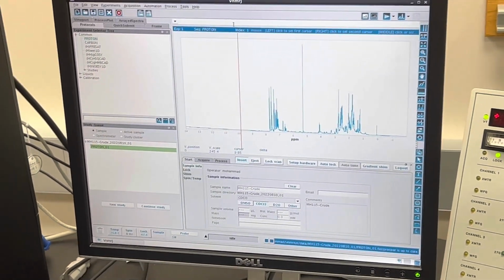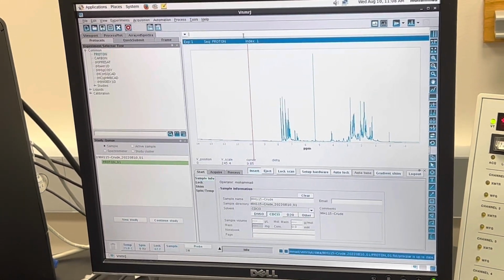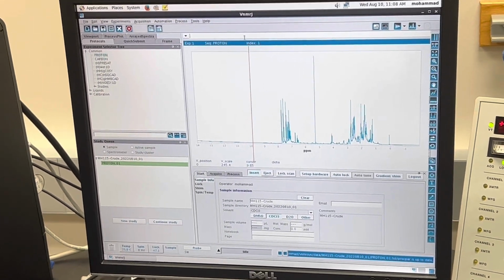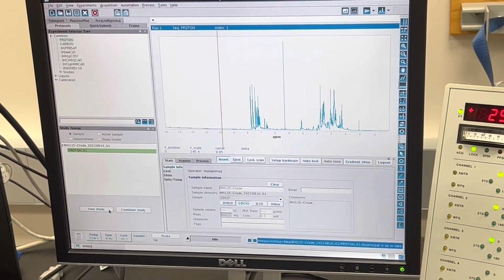So if you want to show expansion or something like that, other software is much better than this. Yeah, I understand. Maybe I will take those shortcut commands from you. Do you have a list anywhere? So it's done, right? Yeah, it's done. It's just some basic stuff.